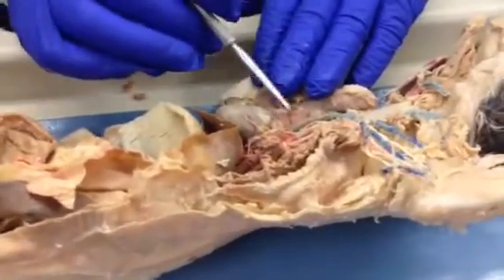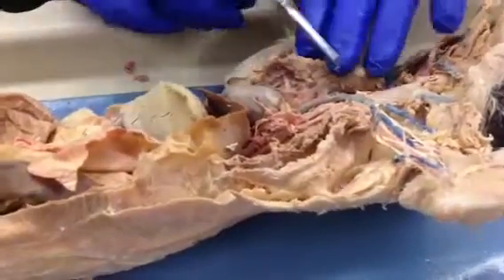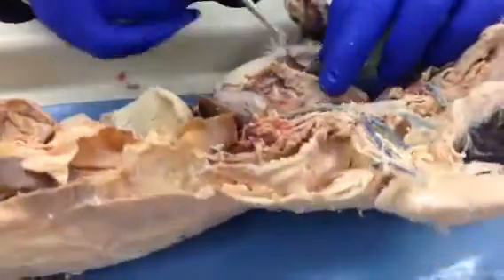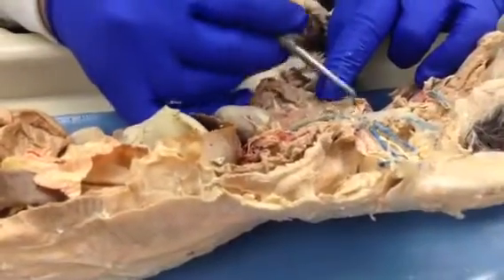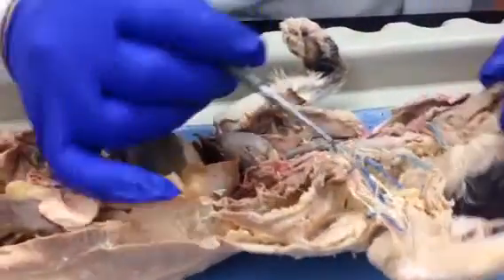Now, all this stuff that was here, the thymus gland, you can get rid of. Just take that right off, and then just use your dull probe and let's see if I can find one that's not done. All you're going to be doing is taking the connective tissue and stripping it back. Follow the vein or the artery where it's going. So you just push this around to get that to happen.